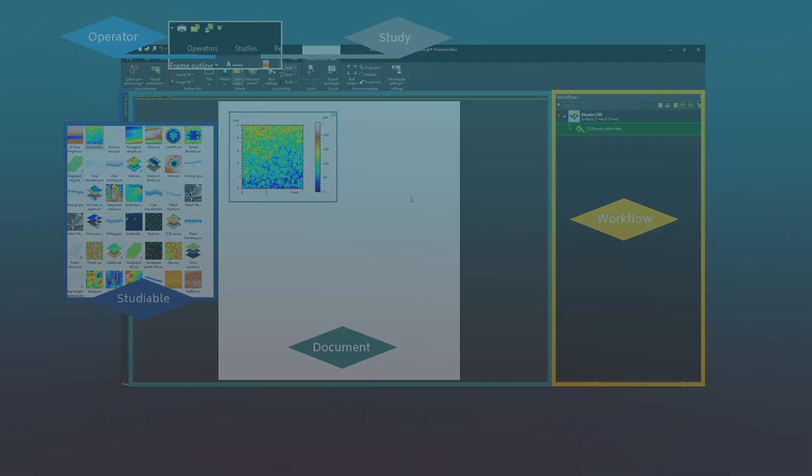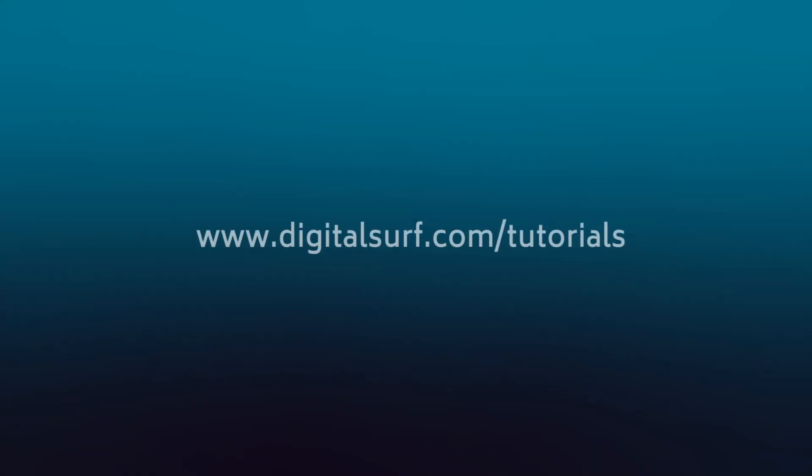Now you're ready to start using MOUNTAINS. If you'd like to learn more, check out the next tutorial in this series.